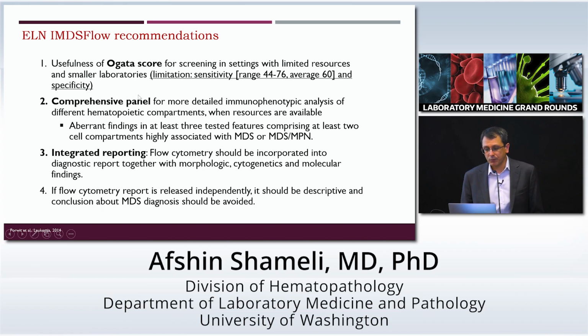One of these publications in 2014 gave these recommendations for flow cytometry in MDS. First, they indicate the usefulness of the Ogata score in the setting of limited resources and smaller laboratories, but they acknowledge that this scoring system has lower sensitivity.